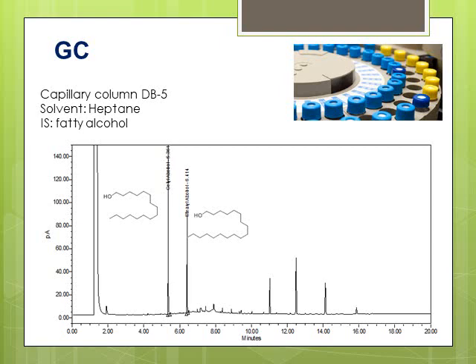This GC method for cetostearyl alcohol determination is very robust, and I rarely use anything other than GC for quantitation. For the two peaks that we see here, you can also look at the ratio of these two alcohols and get information about the ratio of these two fatty alcohols.